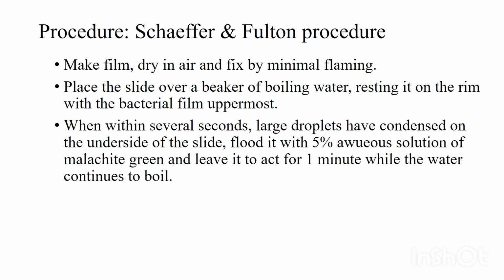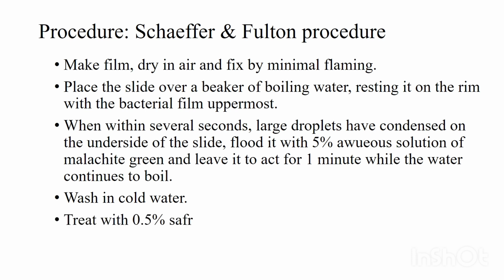The procedure for this malachite green stain for spores is called the Schaeffer-Fulton method, with a modification by Ashby also. Here the films are dried and fixed with minimal flaming.